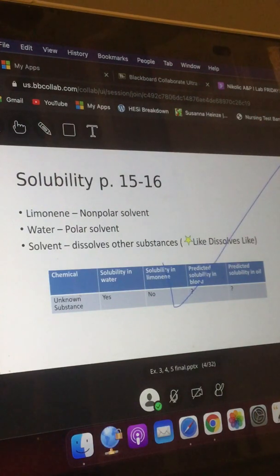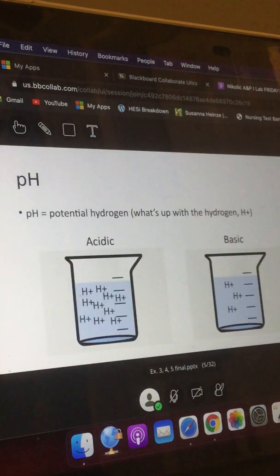That's it. You are now finished our first of three experiments that have to do with pH and also polarity. So the first one had to do with solubility, which has to do with polarity, right? All right, that's great. So now we are going to do our next experiment, which is still on page 16, and it is called pH and buffers. So you guys should be little experts on this by now. So we talked about this in lecture, but some of you may not have me for lecture, so let's go over some basics here. pH means what? Who can remember what pH means?